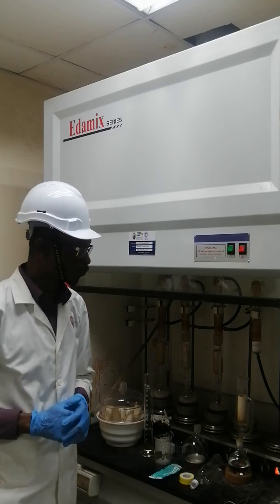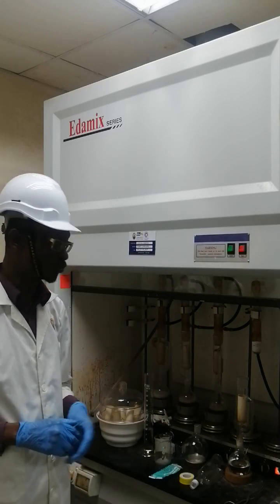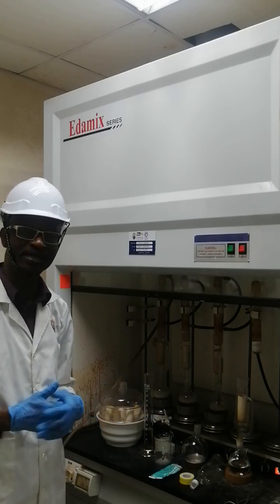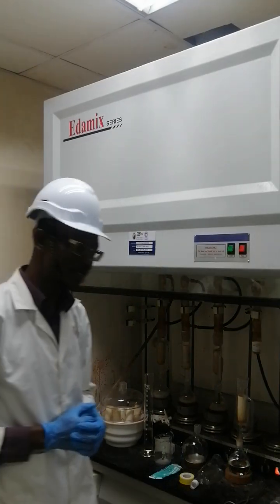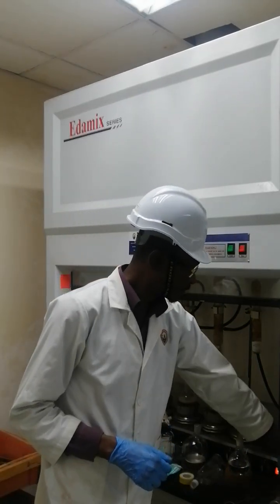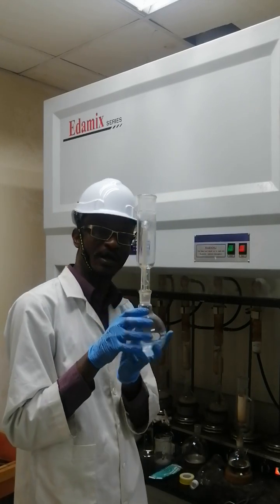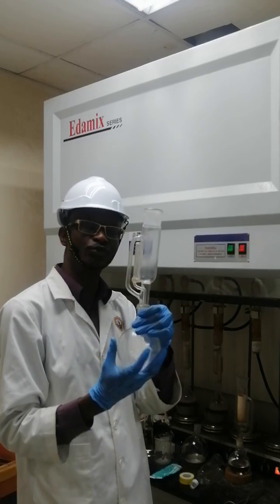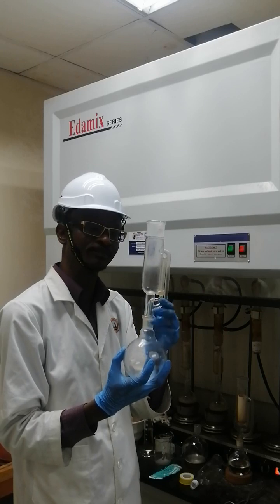Today, we'll be looking at the Soxhlet apparatus, the use of Soxhlet apparatus. Soxhlet apparatus is actually used for solid liquid extraction. Soxhlet apparatus looks like this. Usually it's a glass equipment used for solid liquid extraction, or what is known as leaching.